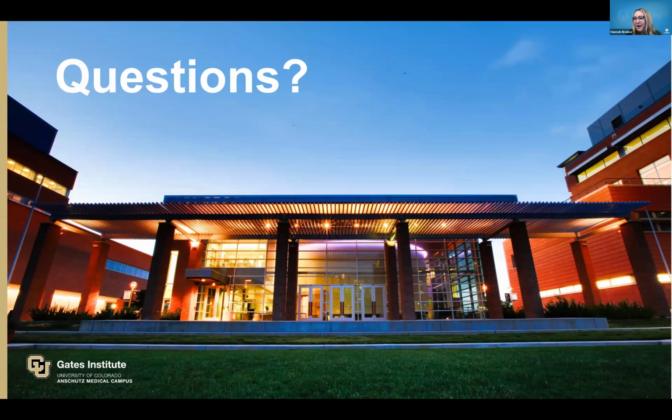Awesome. Good to hear. Someone was asking if you're printing labels from within Sample Manager or doing that outside. We haven't started that yet, but there's actually a big push from elsewhere in our organization to start that barcoding. Being able to incorporate that into our freezers without having to go through some other third party or extra steps, I think we're really looking forward to. So at the same time that we can put barcodes on our ambient storage in our warehouses, we will be able to add it into our freezers seamlessly as well.